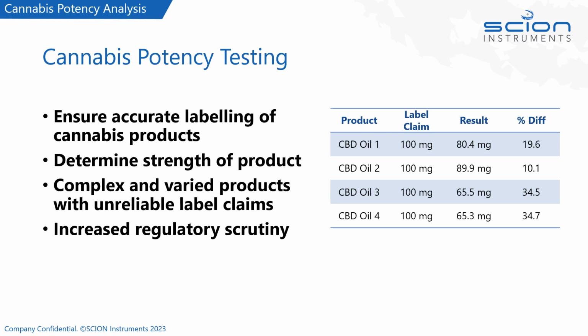With governing bodies such as the FDA, the US Food and Drug Administration, looking to review their regulatory guidelines on cannabinoid products, it's becoming increasingly crucial to be able to accurately quantify the active components in cannabis products.